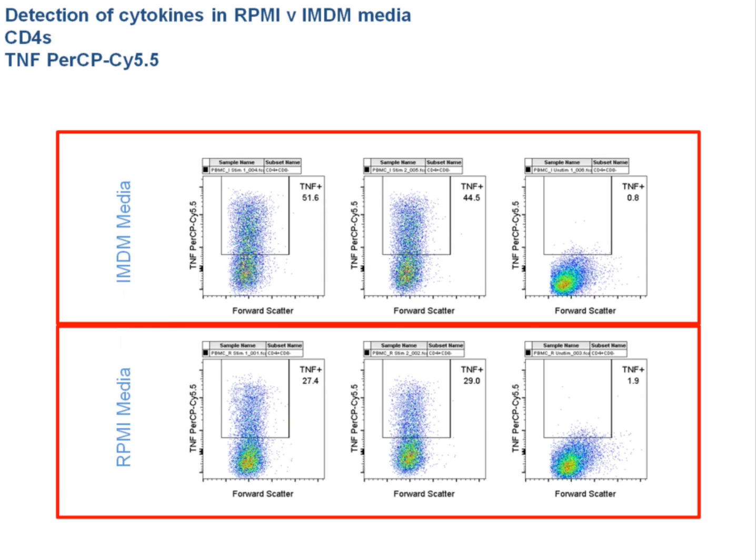Okay, we've had another question pop in, so we've got time to answer this one. Sure. This viewer says, I'm actually working with human gamma delta T cells. Usually without culturing, we have smaller amounts of cells. Do we need more cells for ICS than for usual FACS surface staining due to cell death? And what is the appropriate number of cells in a sample?